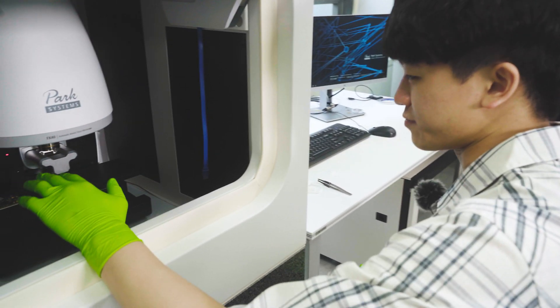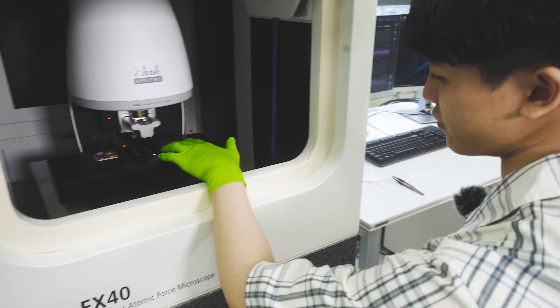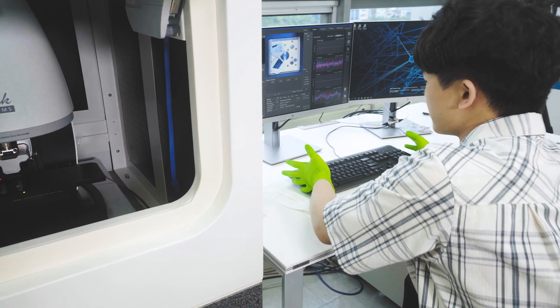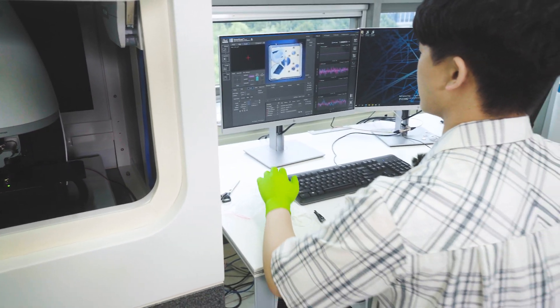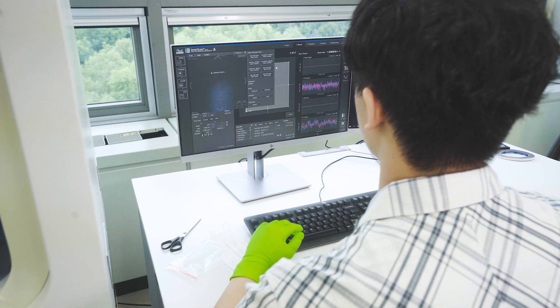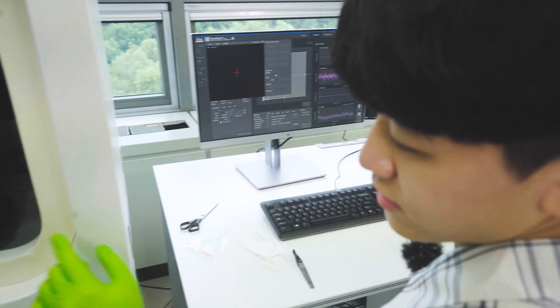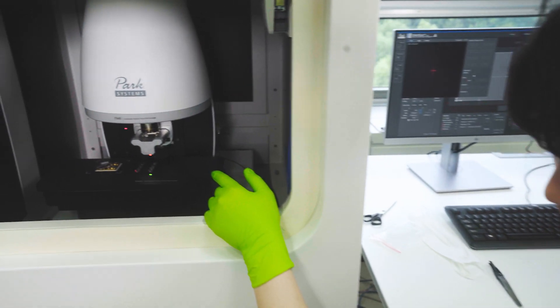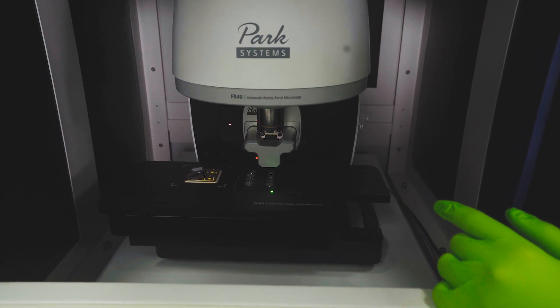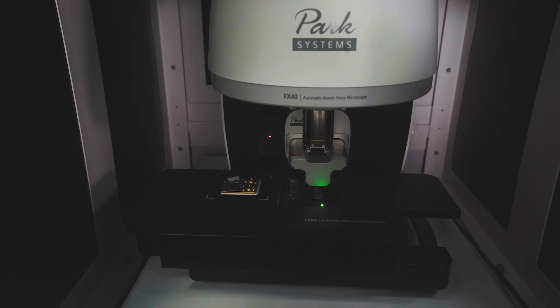Now that we have the samples in place, I'm going to be picking up one of the chips with the probe hand using the computer. First we go to probe, then probe pick up, and we can see that the head is starting to move automatically. It will pick up the chip using magnetic force.